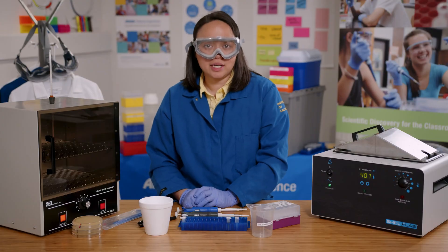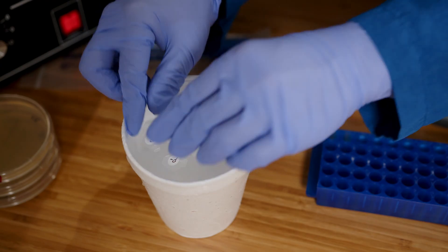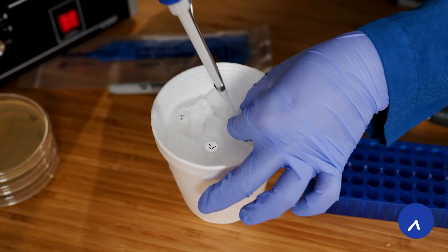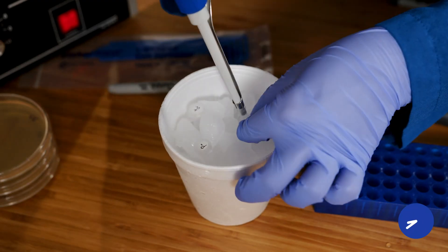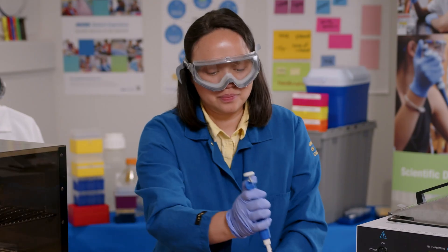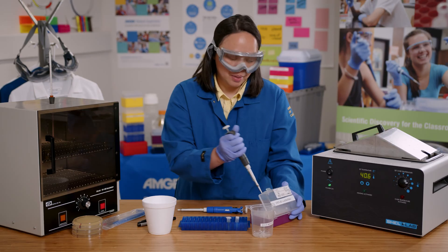Since I want to keep everything as cold as possible, I'm going to keep my tubes on ice while I get 50 microliters of competent cells. In class, your teacher will have the competent cells and will aliquot them directly into your chilled tubes. Next, I will add 10 microliters of the plasmid to the experimental tube.